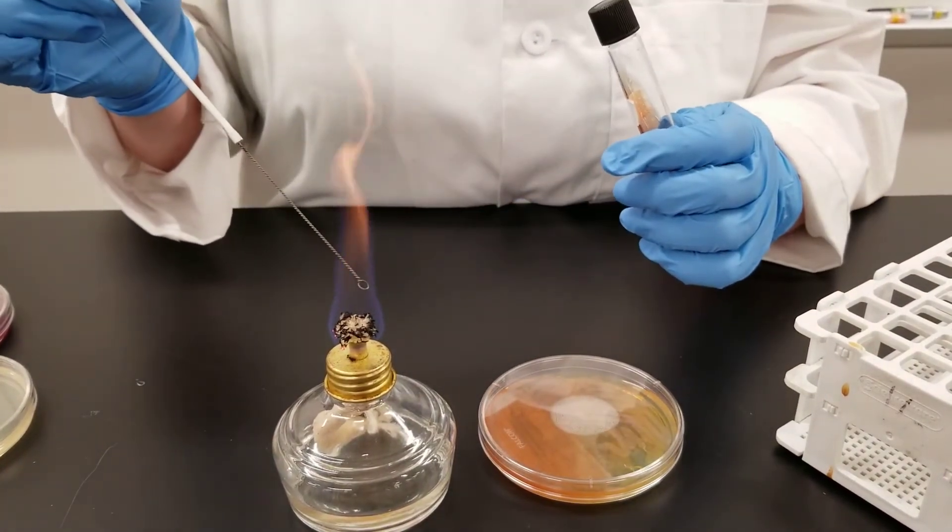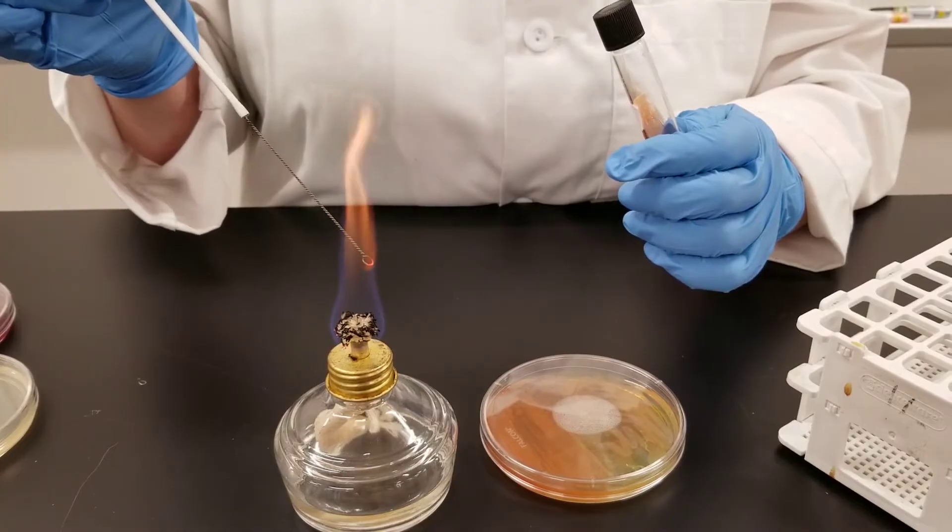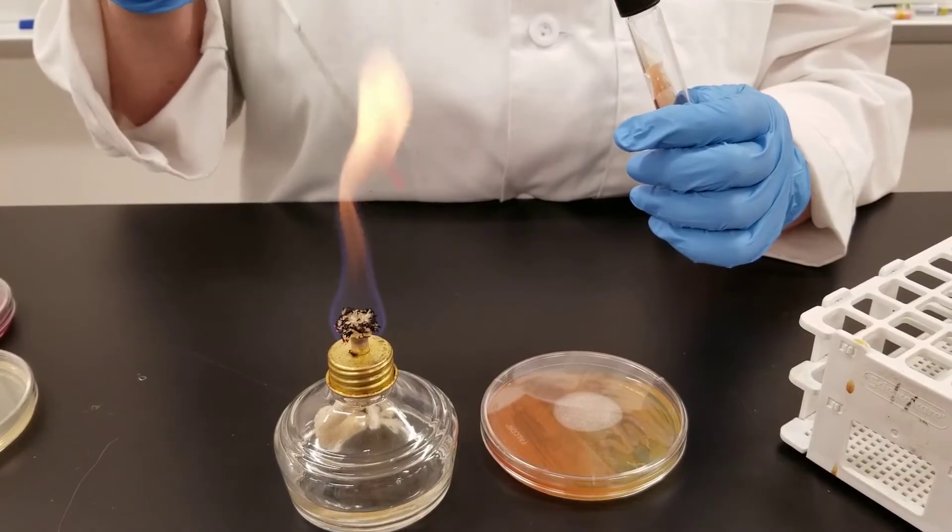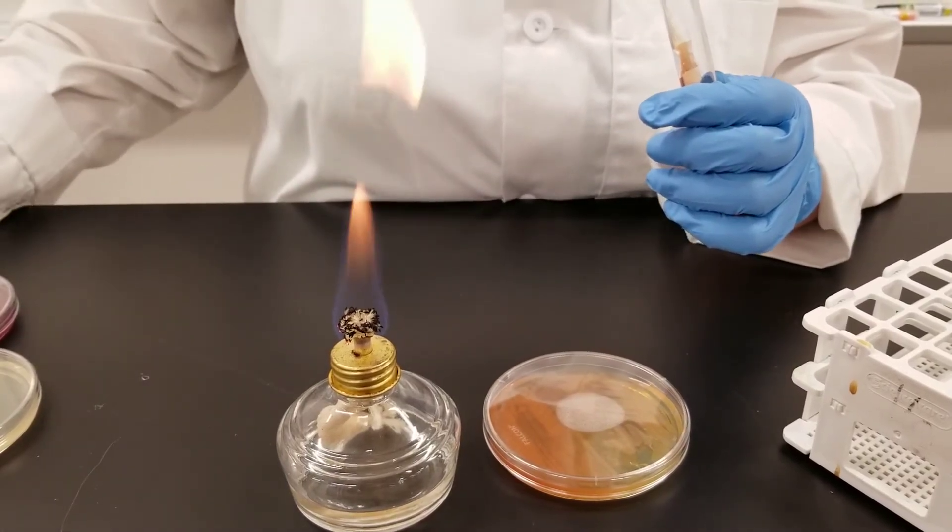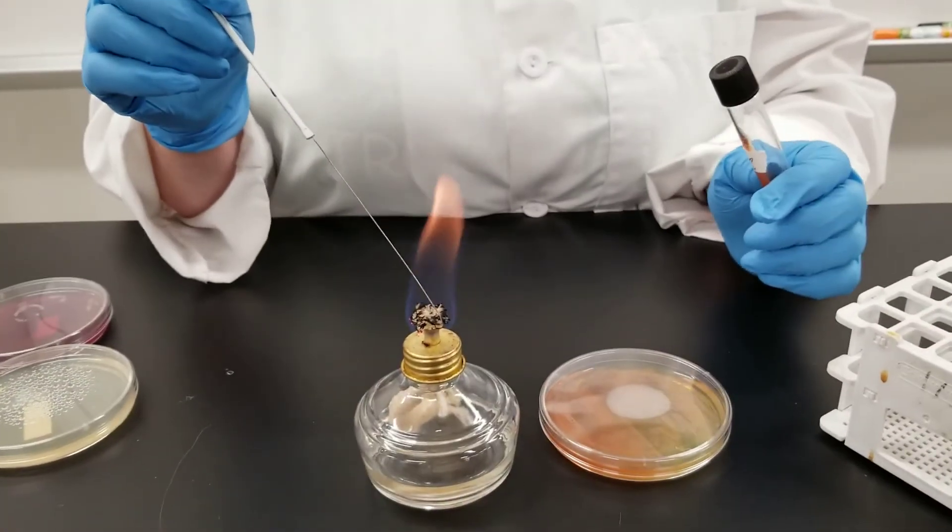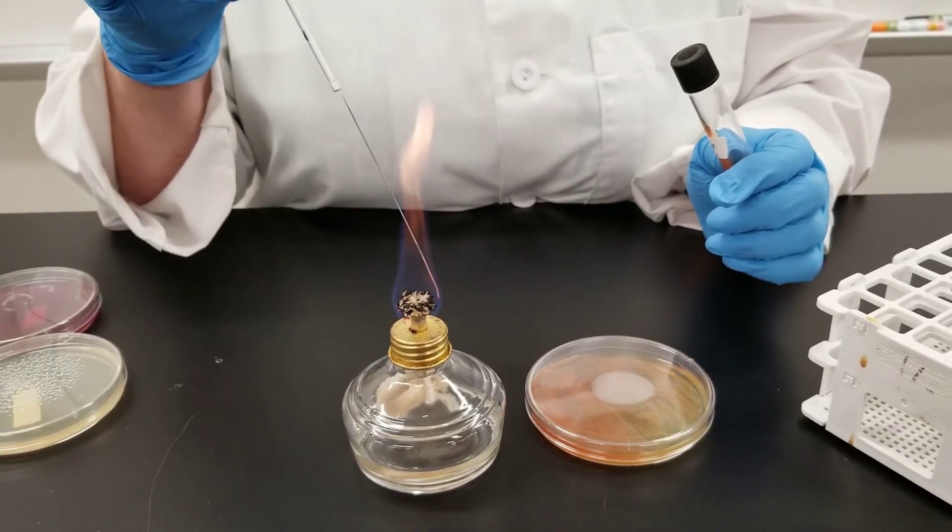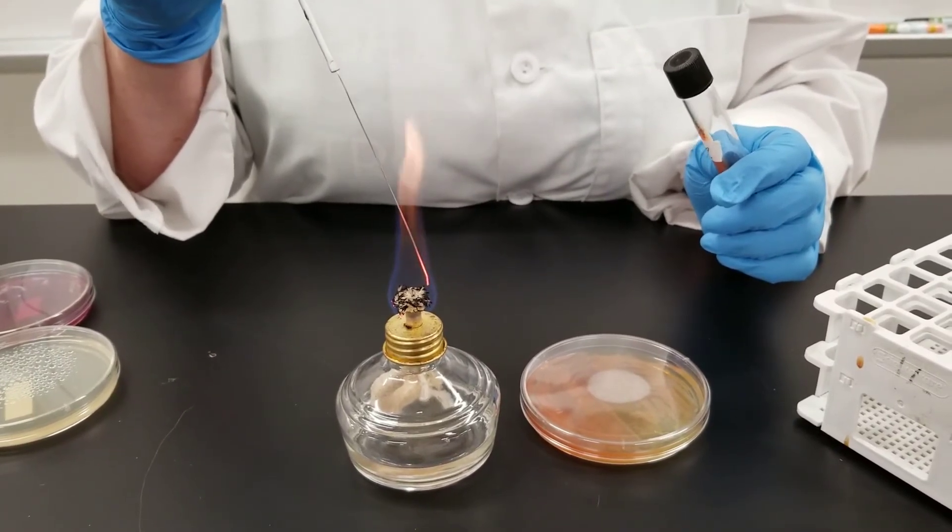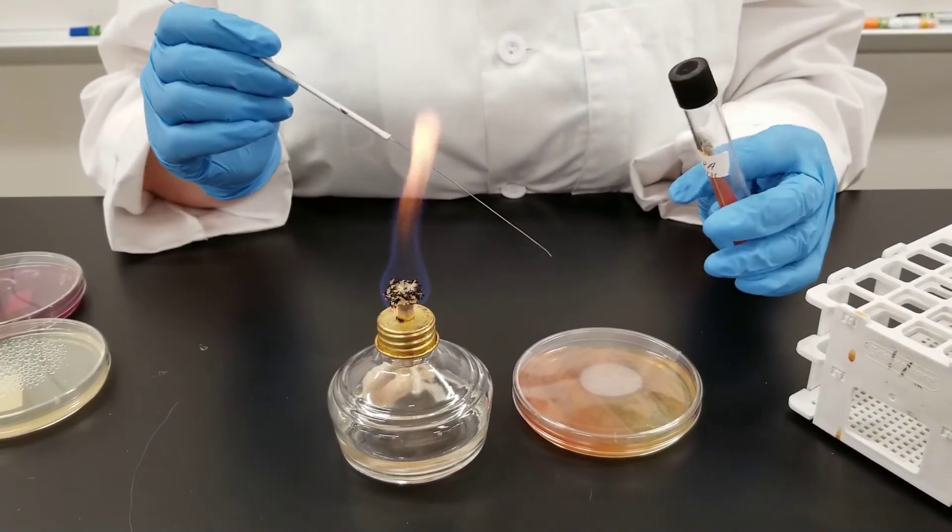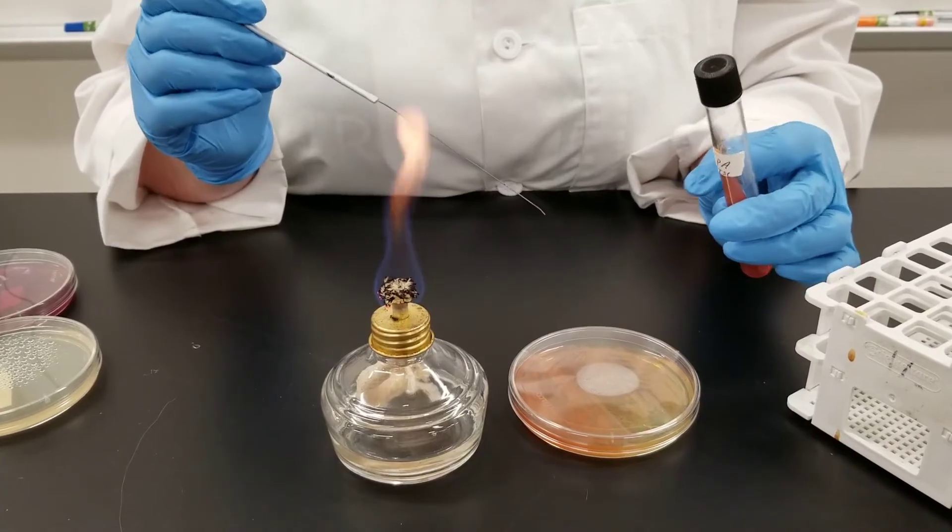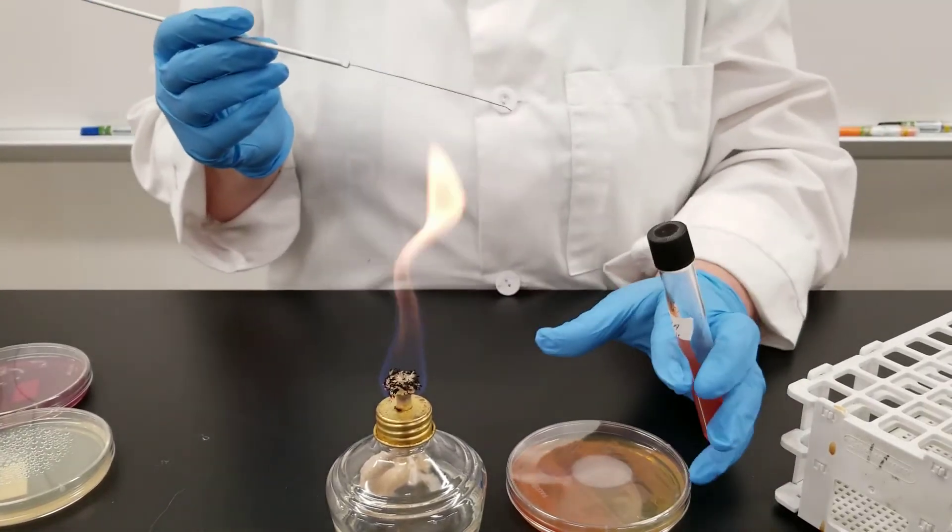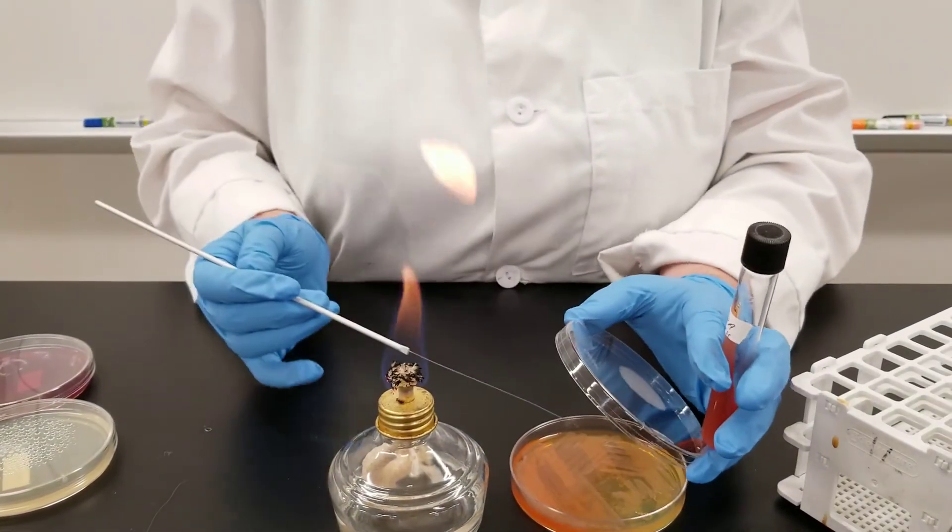Flame your loop. Now we're going to do something a little bit different. Make sure this loop is flamed. We are done with the loop for right now. Now we are going to use the straight needle. You flame it just like you would your loop. When this cools off, what we're going to do is touch the colony again on our stock plate and this time we're going to do a stab down into the bottom part of the tube, which is referred to as the butt of the tube. So we are going to get our sample.